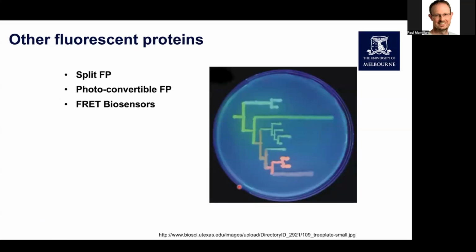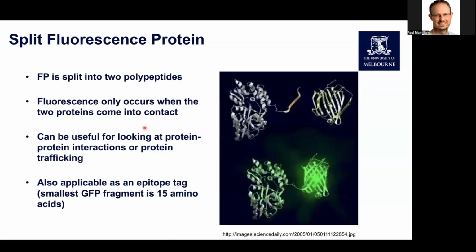All right, so that's standard fluorescent proteins. One thing I wanted to look at is some other potential applications of fluorescent proteins. We'll go through three of those over the next few slides.